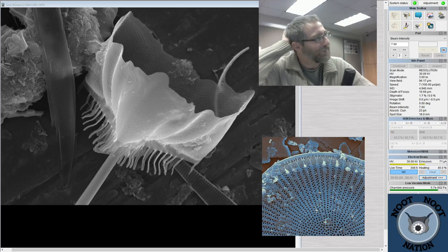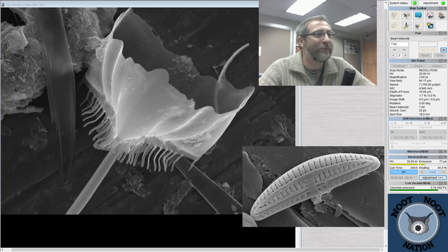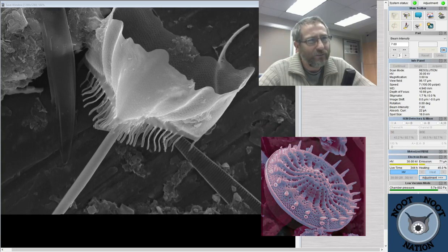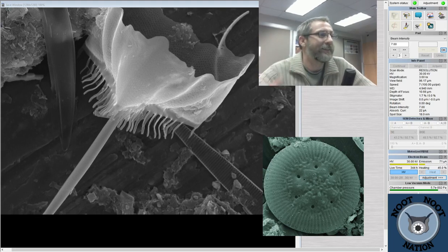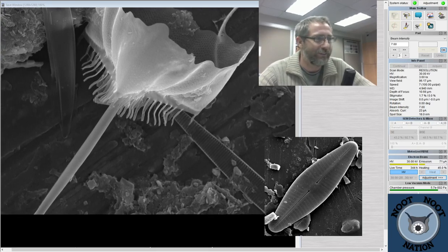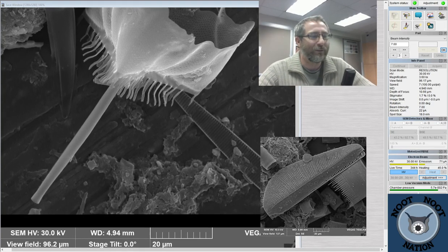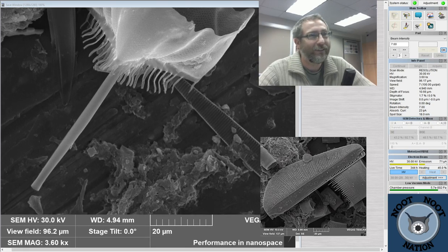Yeah, harmless for the most part, Kilothon. In fact, there is a diatom in the sample that's a baddie. In the marine waters, there is one genus of diatoms called Pseudo-nitzschia, which there might be one in the background of this image, actually, that can generate toxins. Because the diatoms will get consumed by fish and lobsters and whatever else is out there, the toxins can build up in other organisms' systems. And then when you eat those, it could be damaging to people. Or if you took a big gulp of seawater, which I wouldn't recommend in the first place, it could be damaging to people directly.